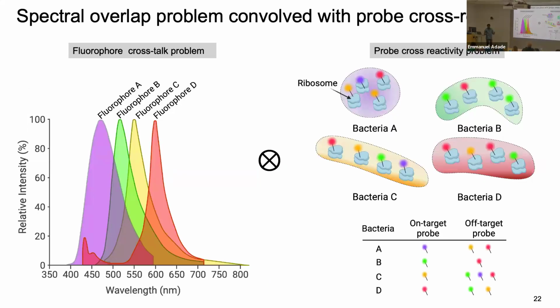So I presented there's 2 problems, which I'm simplifying here. When you perform imaging where you have multiple fluorophores, and I'm talking about fluorophores between 6 and 9, you are going to select fluorophores with emission spectra that fall within the range of your detection limit of your microscope, right? So we have a wavelength constraint. So you have an inherent problem of fluorophore crosstalk. And if the peaks are not well separated, it becomes inherently hard to identify or to unmix those fluorophore signals as true signals for one cell. So this is inherent. We know we have to deal with this.